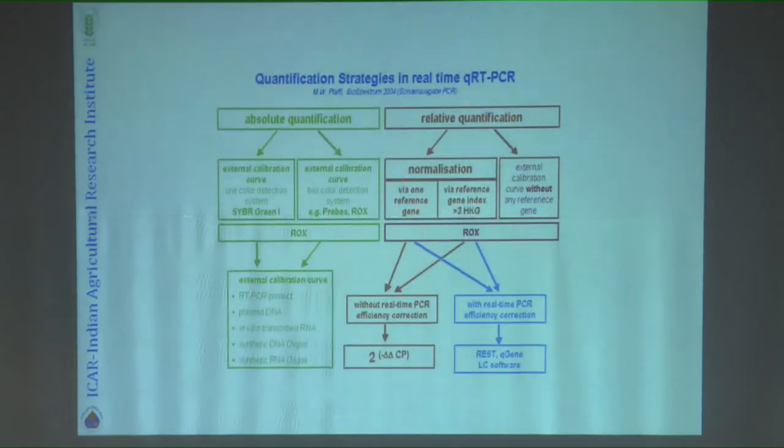So we have absolute and relative quantification, where we talk about several methods. This is one slide which summarizes several of them. Probably you will be given the whole slides, I don't know. But you need to appreciate the drawbacks and advantages of these two methods.